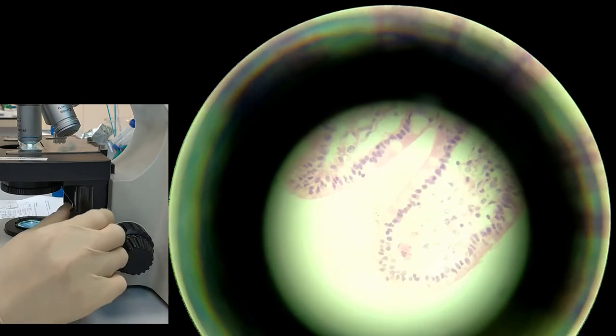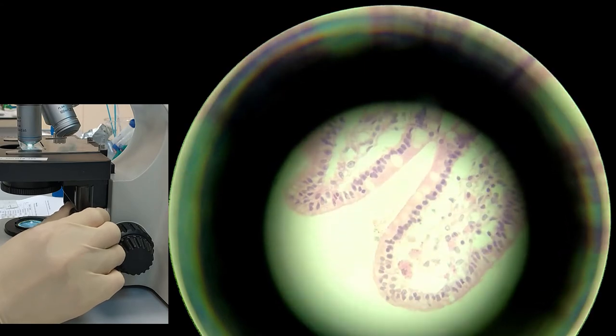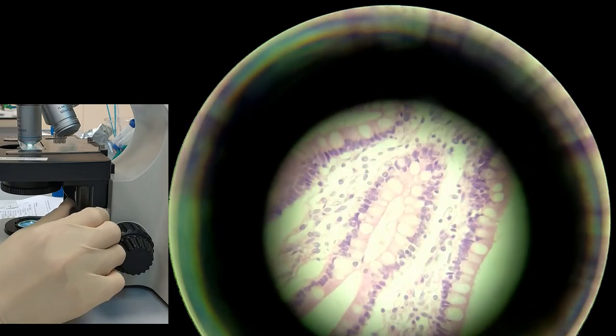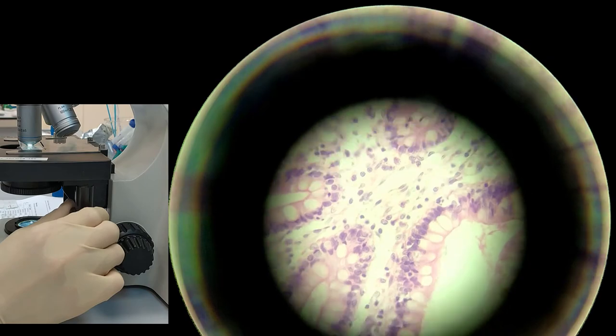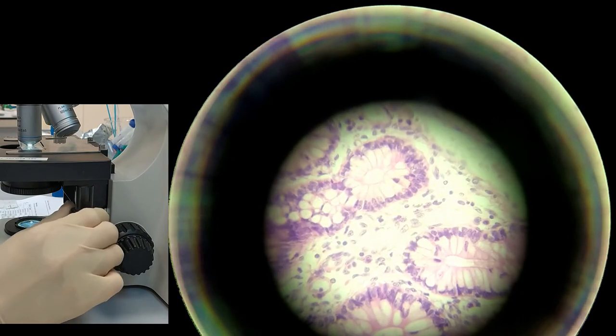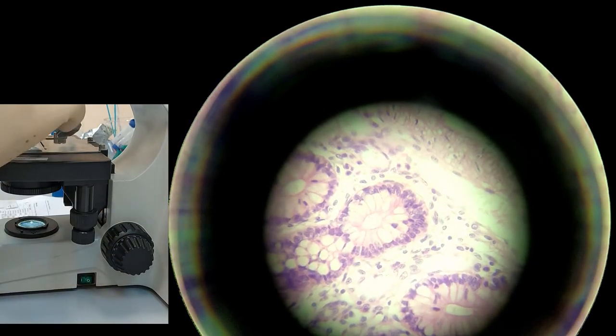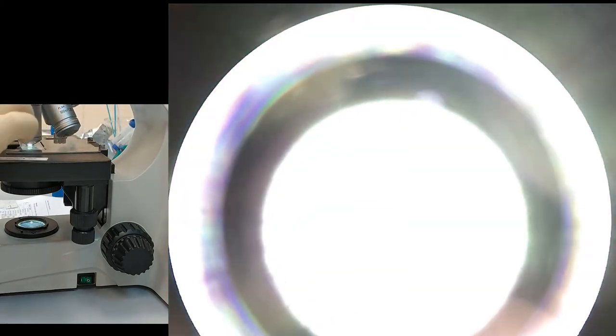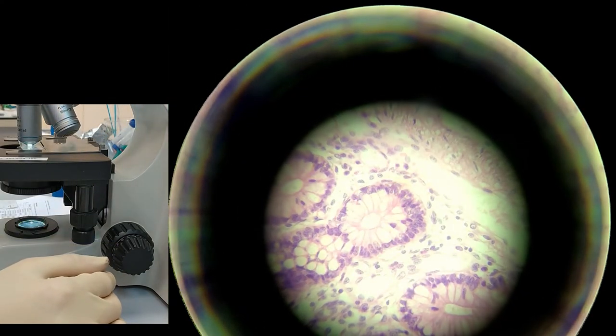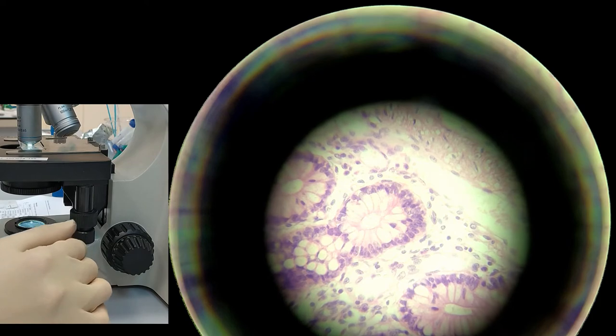As you can see, they are made up with the cells, columnar cells. You can start drawing them whenever you like the view.